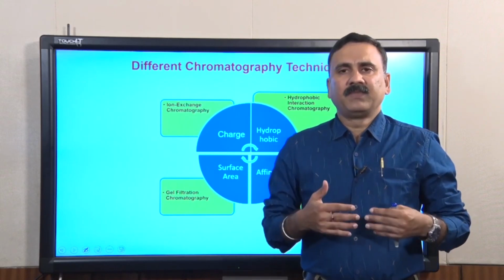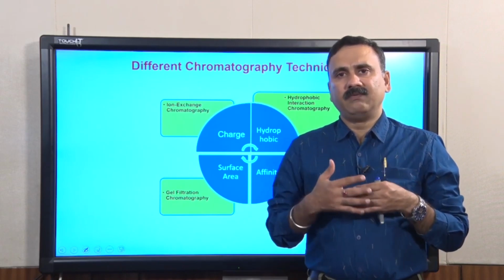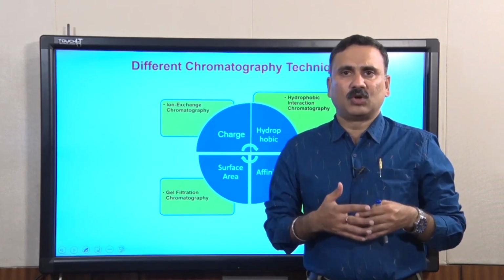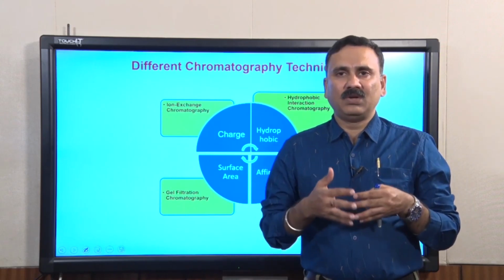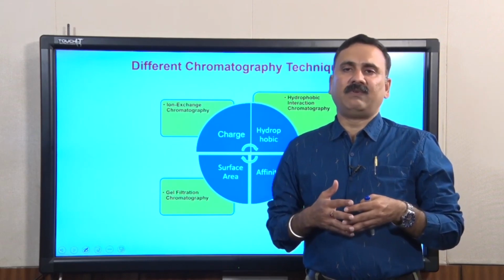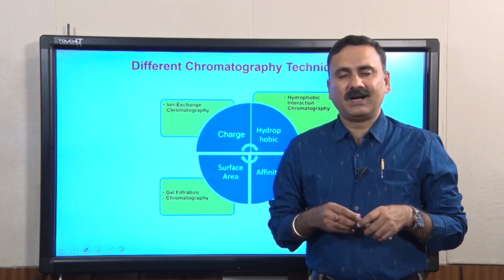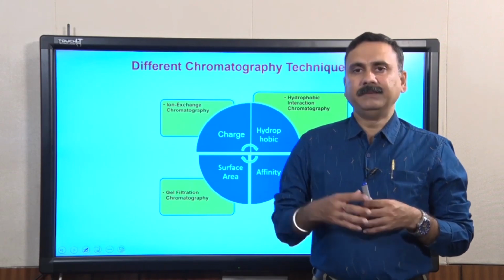Now today in this lecture we are going to discuss the different types of affinity chromatography and how to perform them, and at the end of this lecture we are also going to discuss the applications of affinity chromatography. So, let us start with the first examples of affinity chromatography.